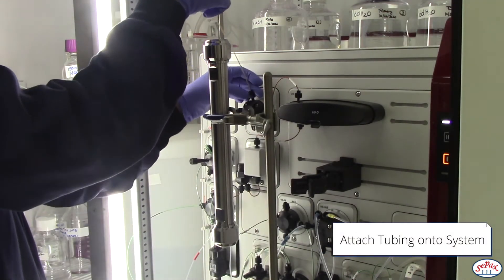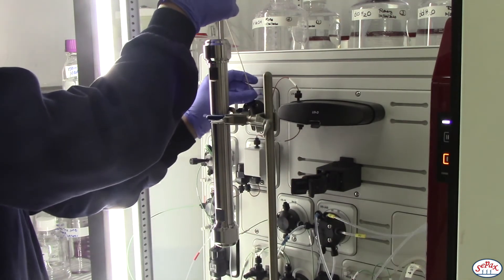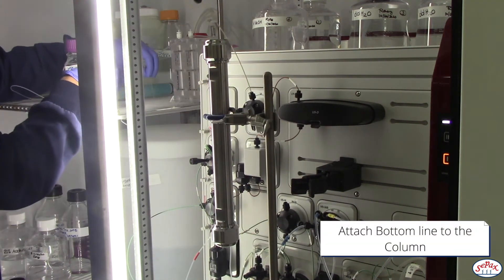Attach the tubing to the inlet and outlet port on the system, and attach the bottom line to the column.